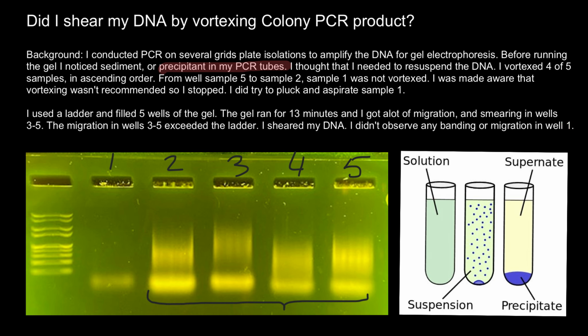First of all, this person sometimes starts counting from this well as 1, and sometimes he refers to this well as number 1. So just to avoid confusion, I just numbered them. And actually this is not true. The last statement: we do see here a band, though not as bright as in the other wells. Now let's analyze what we see in this picture.